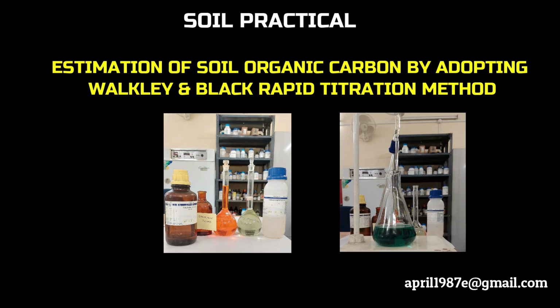First of all, I thank you for taking your valuable time and interest in this laboratory-based video. In this video, I'll be demonstrating the steps involved in the laboratory analysis and estimation of organic carbon in any soil samples following the old and widely adopted method called Walkley and Black rapid titration method.